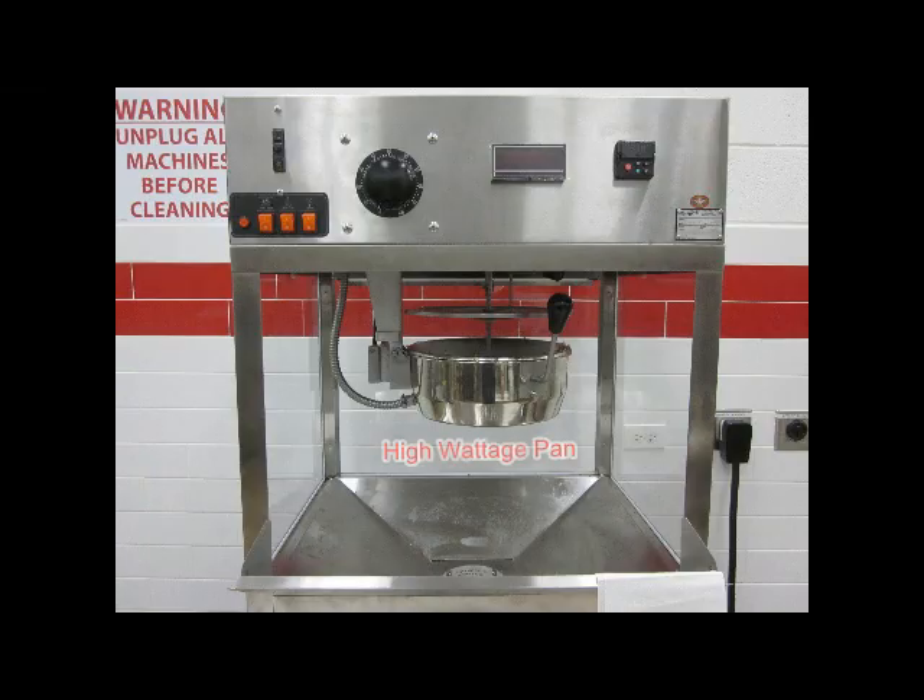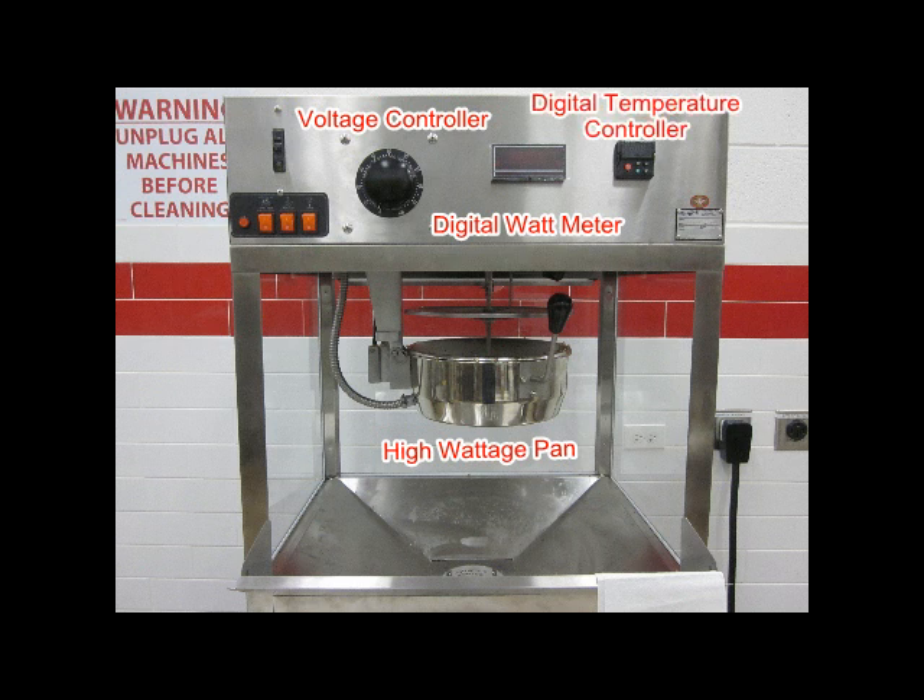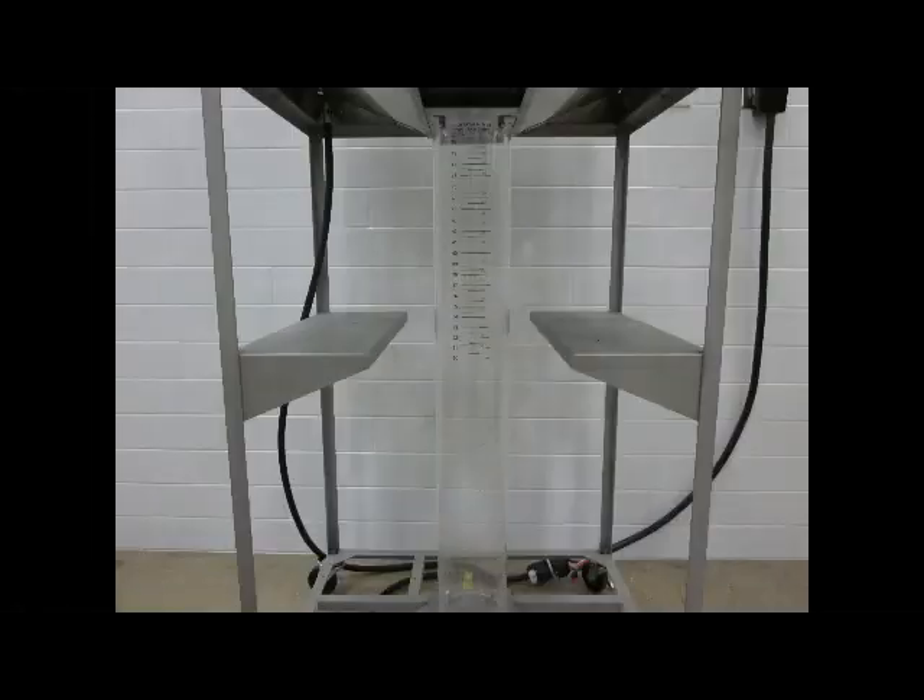The main features of the tester are a high wattage pan, voltage control to permit exact control of the pan wattage, a digital wattmeter to display the wattage of the kettle, a digital temperature controller to ensure accurate oil temperature, and a measuring tube — a large diameter tube to limit bridging of the popcorn in the tube.